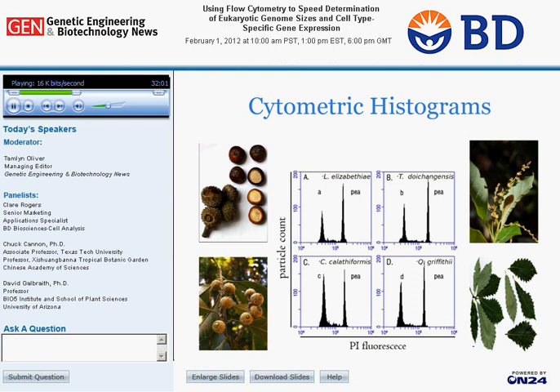There's an internal standard in every one of them, and you can see the P is very sharp and clean. In some of the others, there's other material coming in with these samples, so you get a bit of scatter, but there's a very clear peak. So you can very clearly and objectively measure these genome sizes for these 4 different species and 4 different genera. The machine performed very well. We were very happy with this. Next slide.